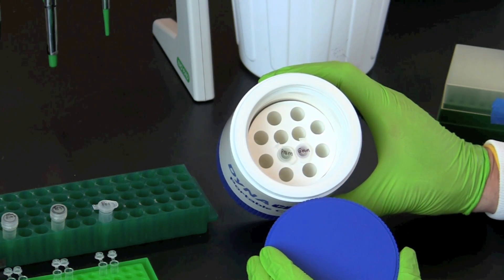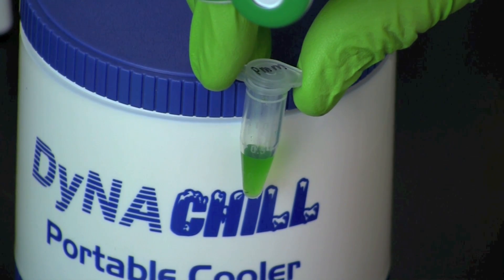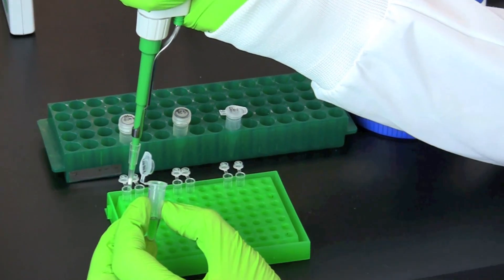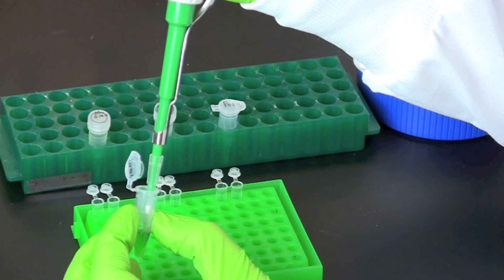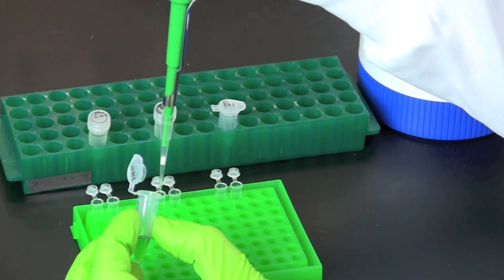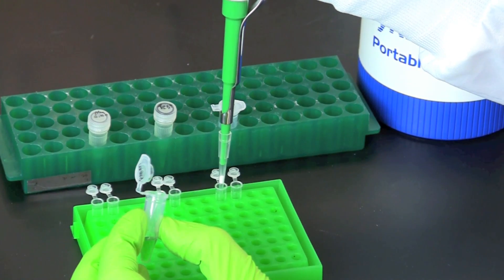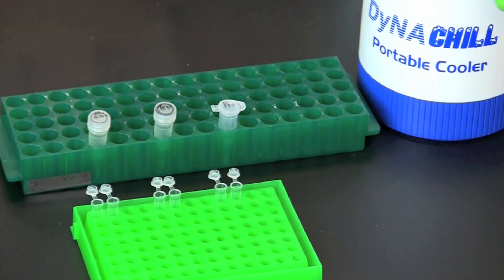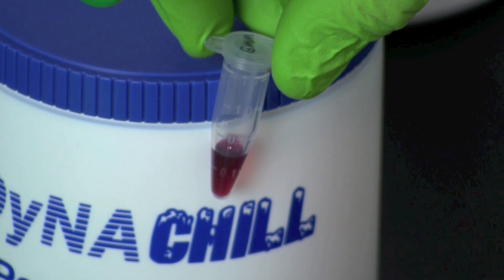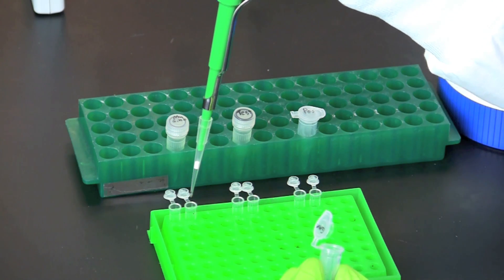The master mix should be kept on ice until you are ready to use them. The plant master mix is green. Pipette 20 microliters of plant master mix into the corresponding labeled PCR tube for each DNA sample. The GMO master mix is red. Pipette 20 microliters of the GMO master mix into the corresponding labeled PCR tube for each DNA sample.